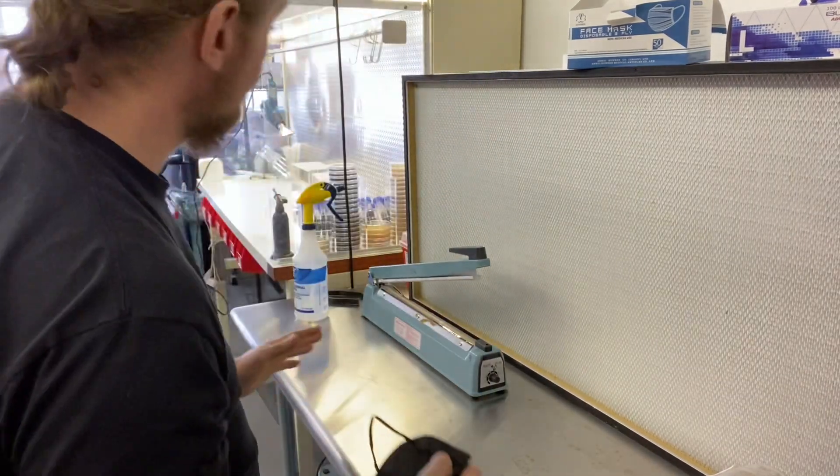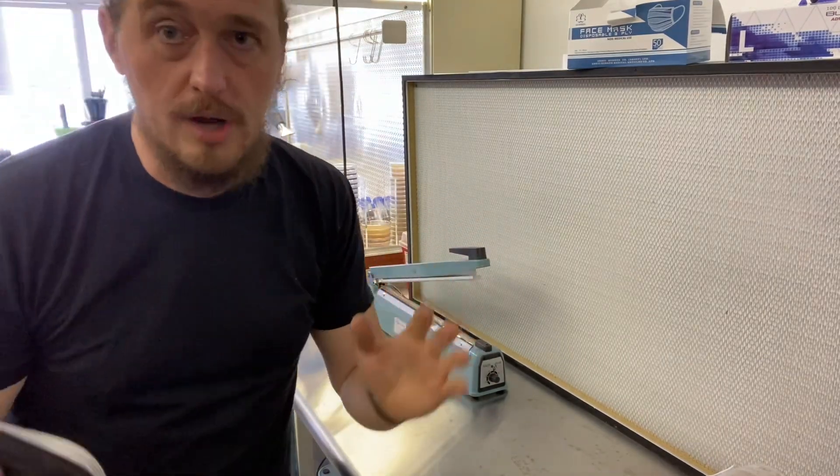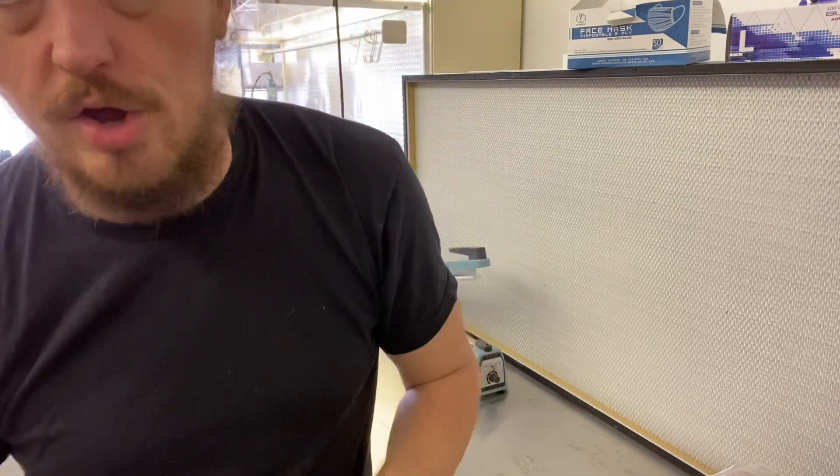This does not make you Iron Man. You are not invulnerable to everything when you are sitting in front of a flow hood. So, if I walk up to this flow hood, let's assume everything here is sterile — and I walk up to it, I haven't washed my hands, I haven't washed my face, I haven't cleaned off my clothes, I haven't done anything.